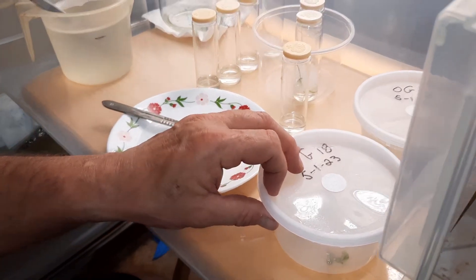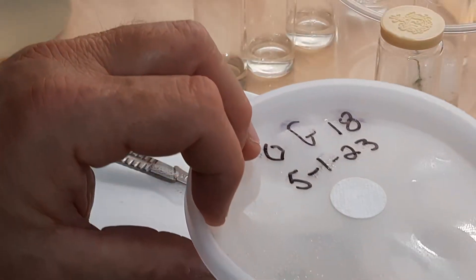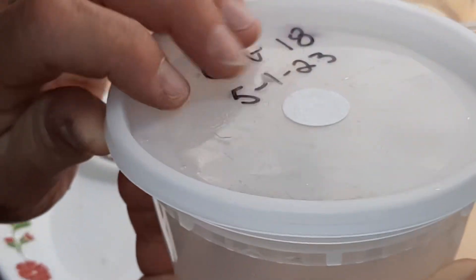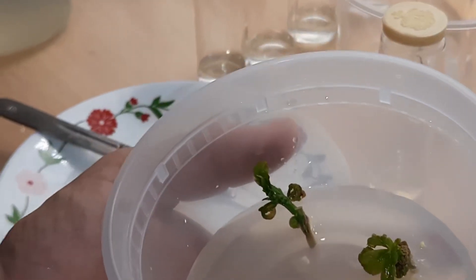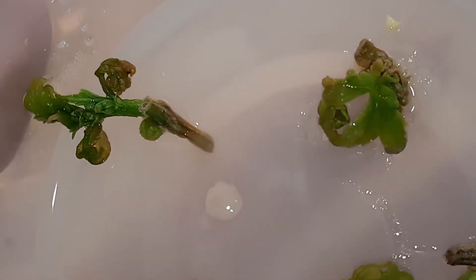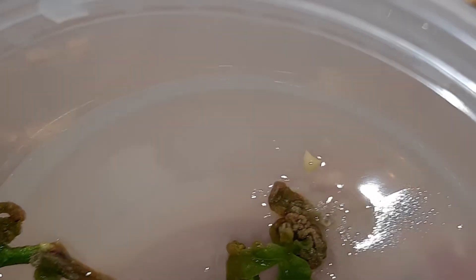I think we're ready now to open up our contaminated cultures. Let me put this on two times zoom. I'm going to try to open this as gently as possible. See that shiny spot there in the middle? That's yeast — that little spot there growing in the agar. That's yeast as well.